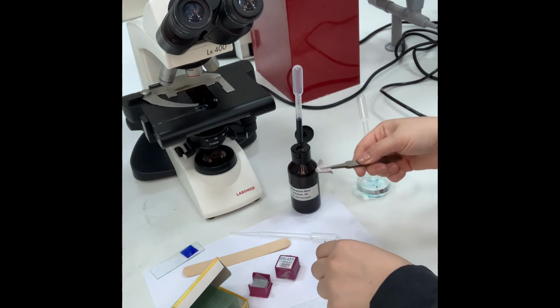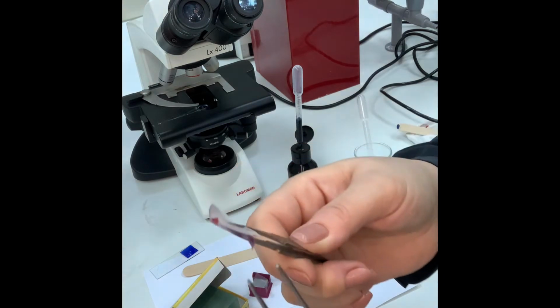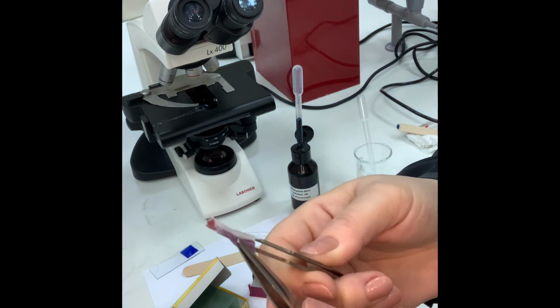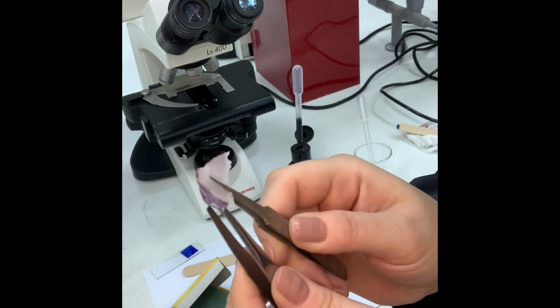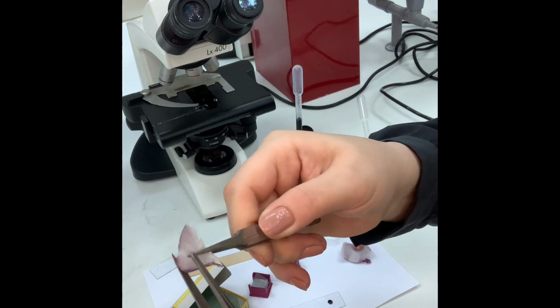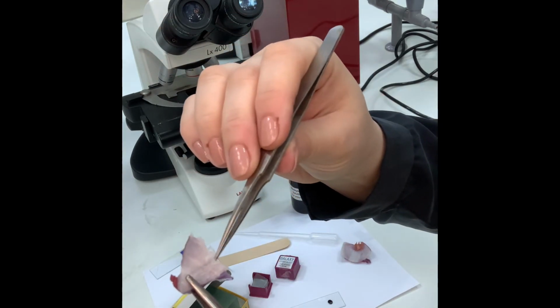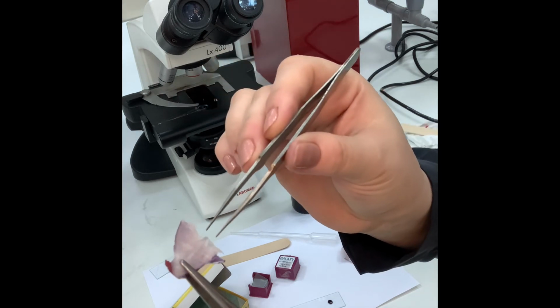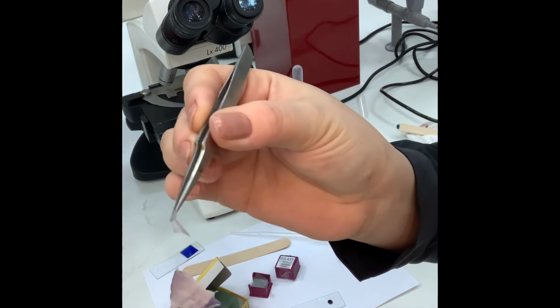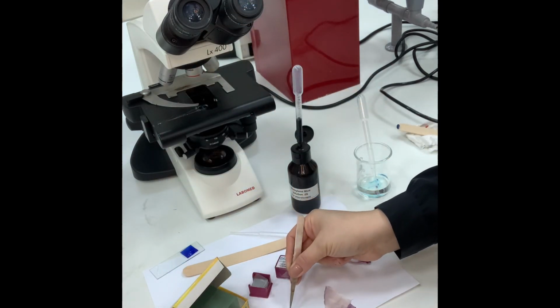Now, why did I cut the onion? Because when I cut it, I need to peel this peeling over here, the outer peel. Can you see it? Very thin, or from inside. And this is better, much easier. Look, this is the one I'm using. See? This is the one I'm using. So I will just apply it on the water.